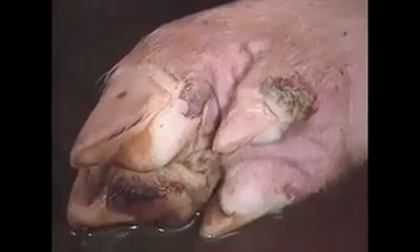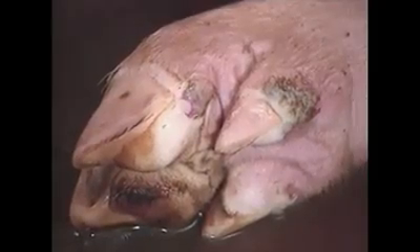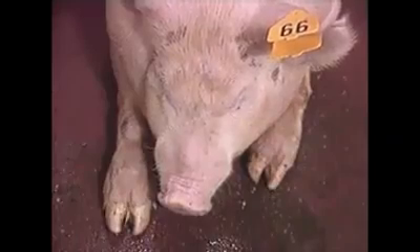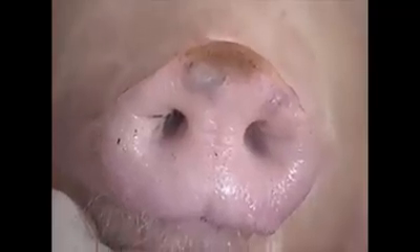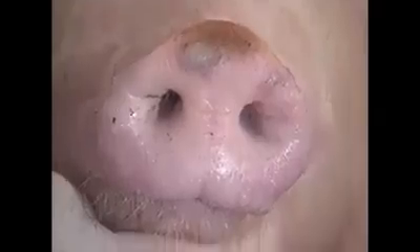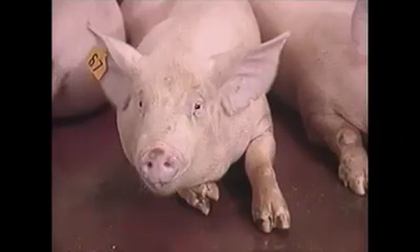Note the ruptured vesicles on the heels and erosion of the skin. Lesions commonly appear on the feet and snout. The brown area is necrotic skin over a dried vesicle. In this more distant view, note the brown area and the coronary band. More lesions are visible on the snout and feet.